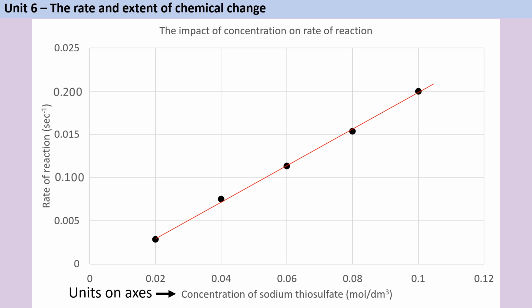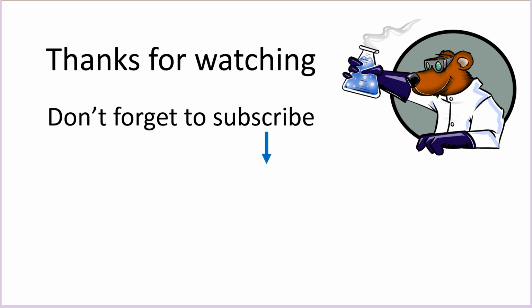And that makes it really easy for me to make predictions about what the rate would be at a different concentration, say 0.05.